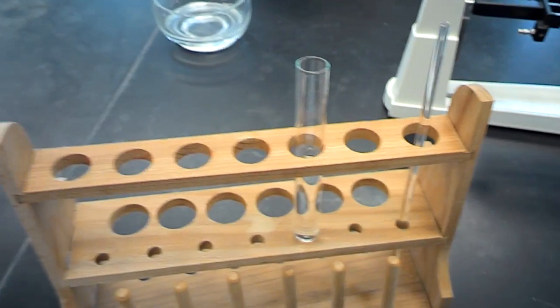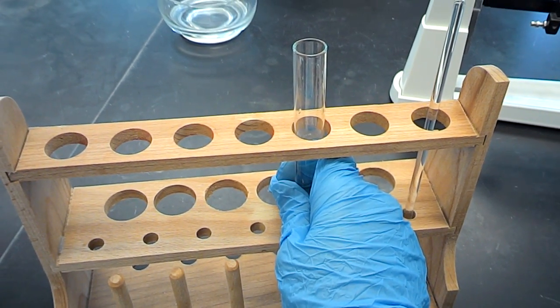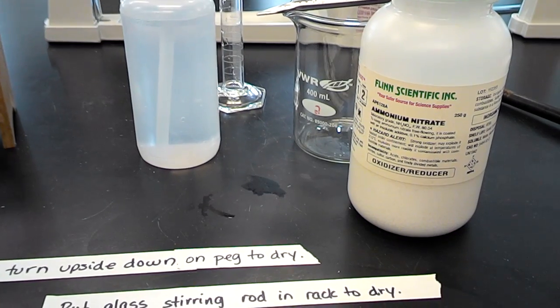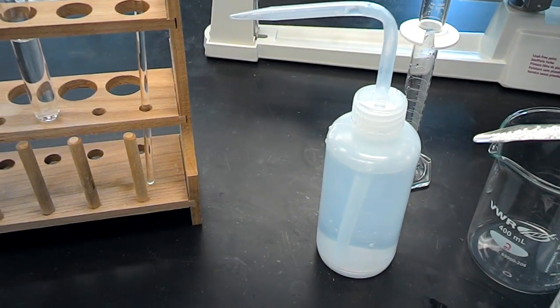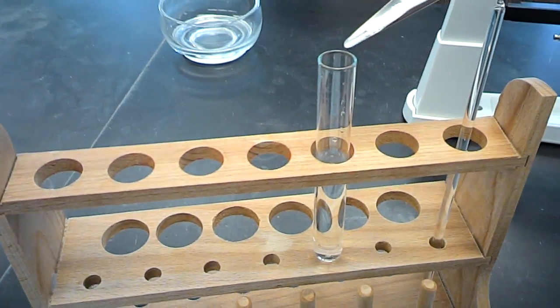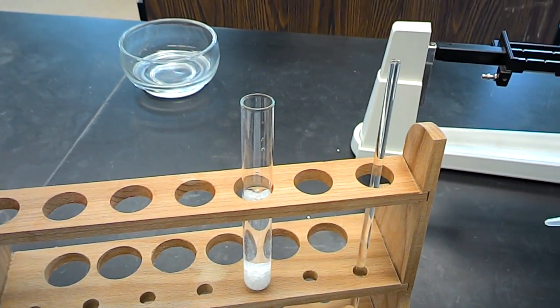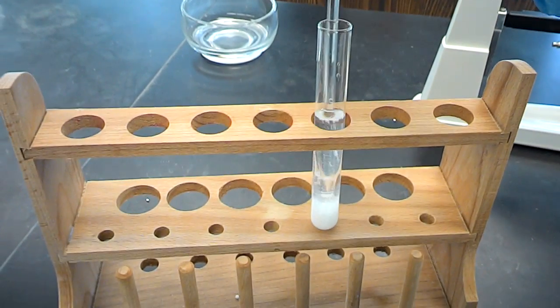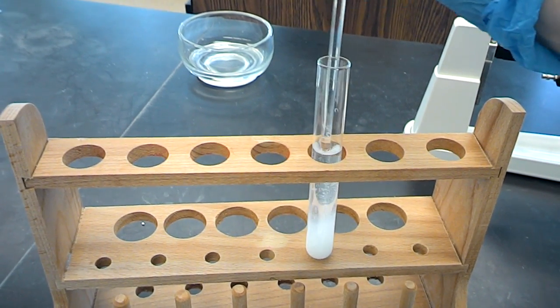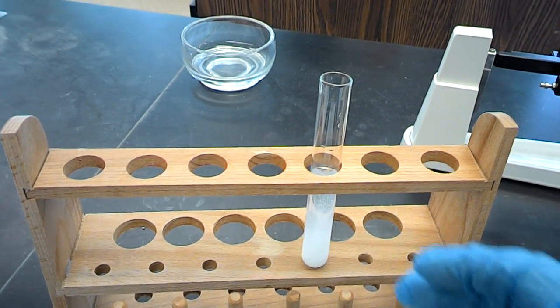Okay. It helps if you take your hand and warm the water a little bit more in the test tube. Just don't break it. Then it tells you to add 1 scopula of ammonium nitrate. I've already pre-measured that, which is just you scoop it in there. It's not a real measure. Now normally I would do this over a trash can, but I only have 1 hand. So, whoops, I'll clean those up. Okay. Now you take your glass stirring rod and you just kind of stir up the mixture. You would clean the stirring rod and wash it and dry it.